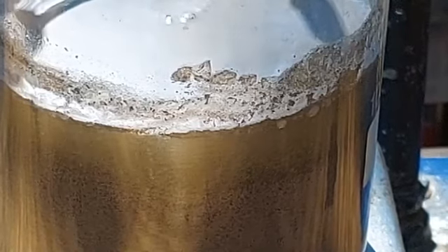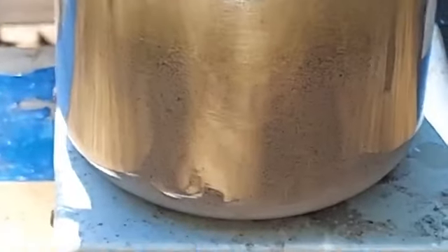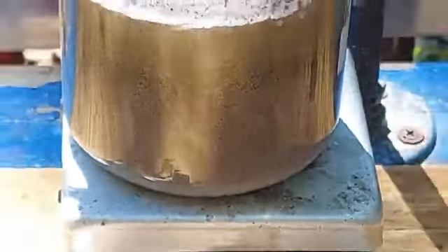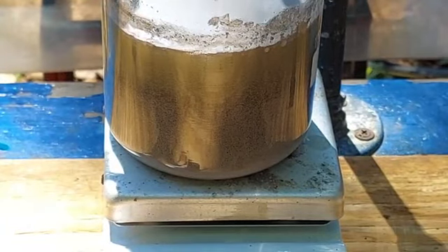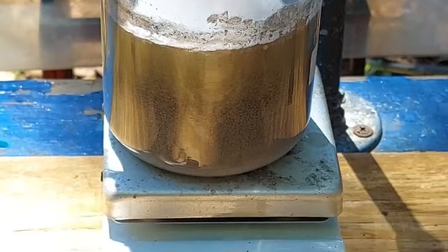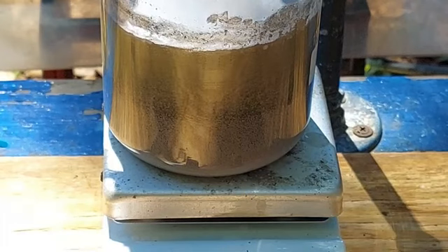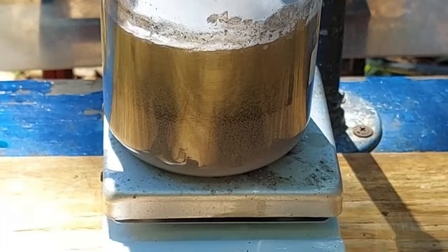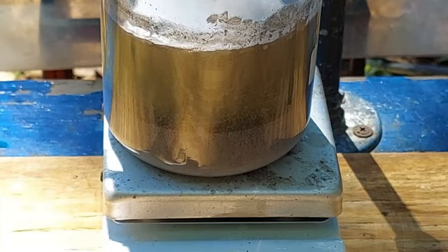That's right. Oh, would you look at that? I don't know. Can you see anything? Probably. It always looks like you guys can't see anything, and then I go back and I edit the video and it looks great. Okay, so yeah, we got our mercury here. It's all just raining down out of solution. There is quite a bit of it in there. Holy crap. Wow.